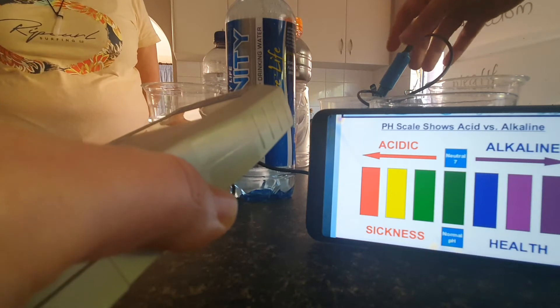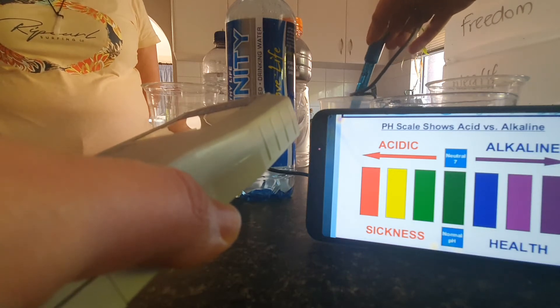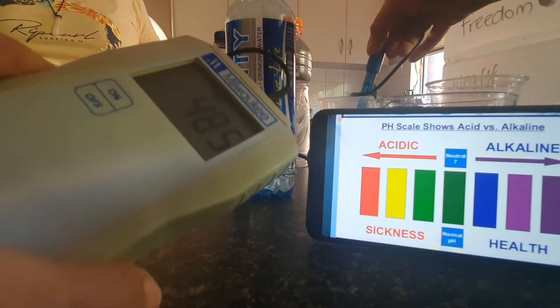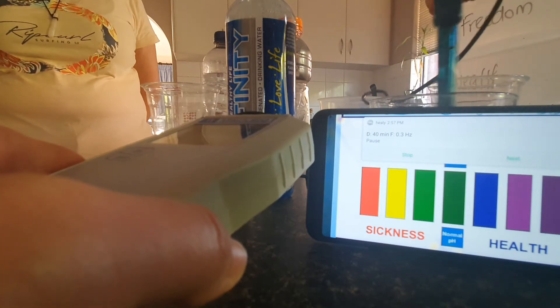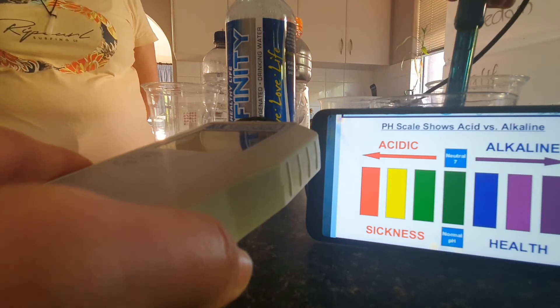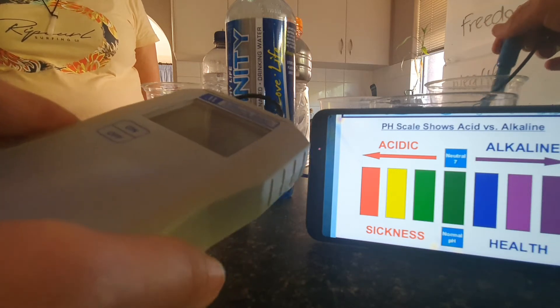Pretty much around that 480 mark — about 480. Still dropping. And then we've got a definite negative there, and then a positive — so not a good reading.